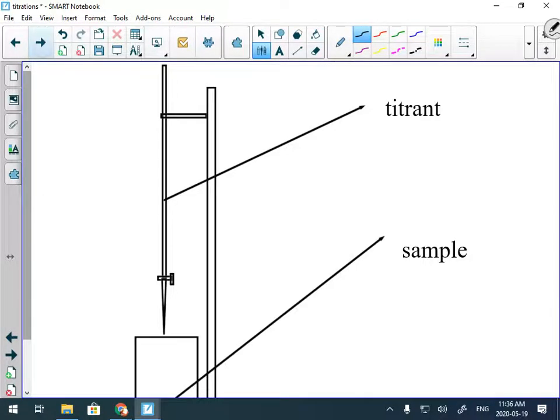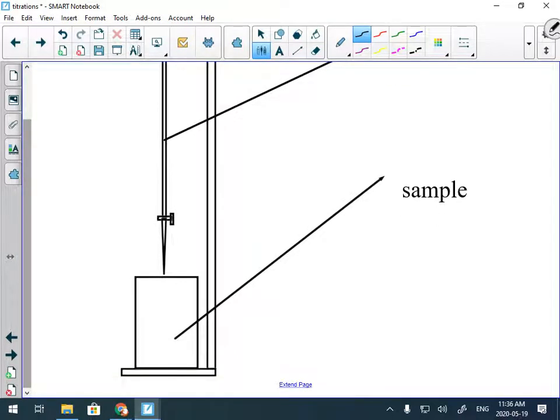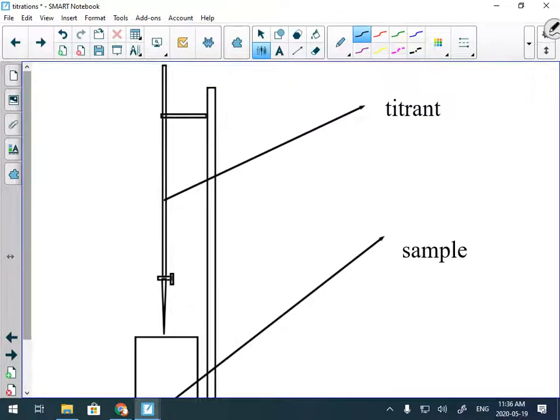All right. This is a very bad drawing of a titration setup. There are these long, skinny tubes called burettes, and then there are these plasticky ends, which are like a nozzle with a little like valve. They're called a stopcock, and that's put into the tube, and that forms a burette.